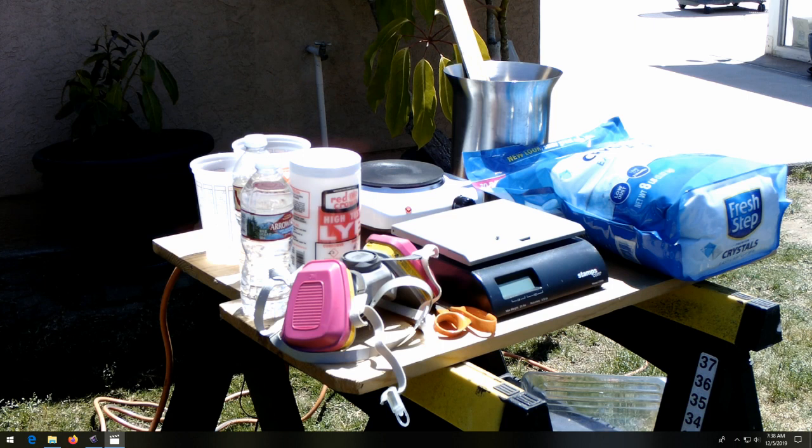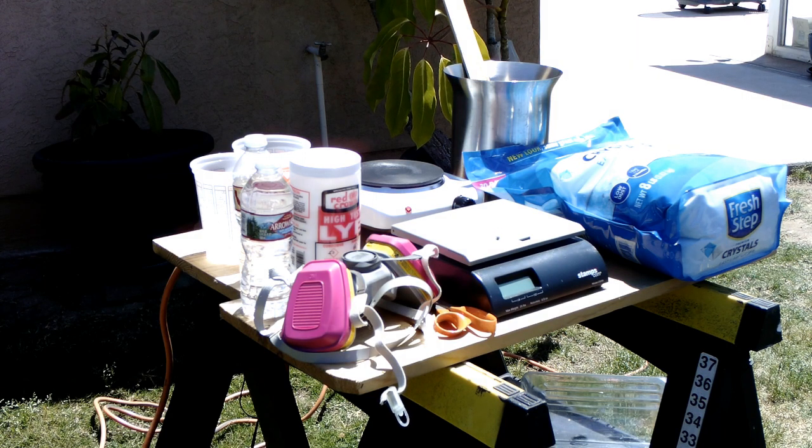Okay, let's make some sodium silicate. So I'm getting ready to make this sodium silicate, also known as water glass. It's a high-temp adhesive.